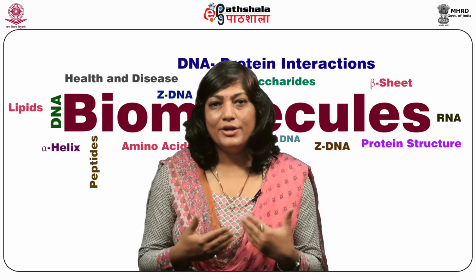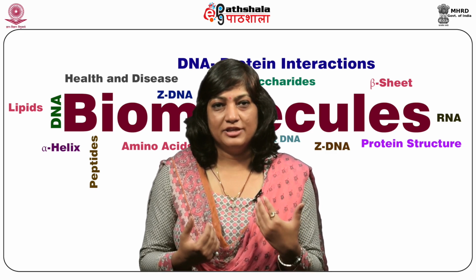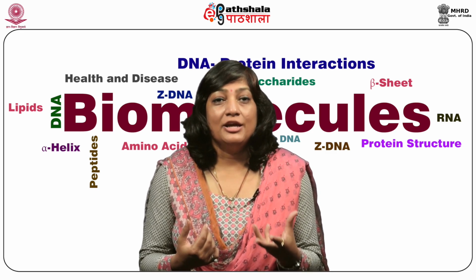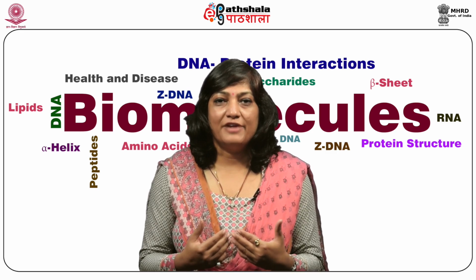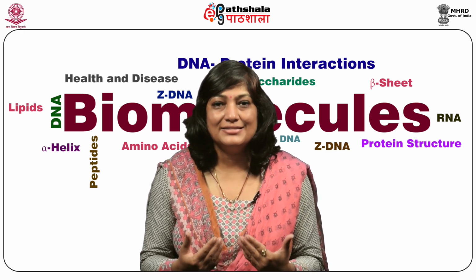Gas-liquid chromatography, on the other hand, is a type of chromatography where the adsorbent, or the stationary phase, is a liquid, and hence the name gas-liquid. In gas-liquid chromatography, the mobile phase, just like in gas-solid chromatography, is also an inert gas.